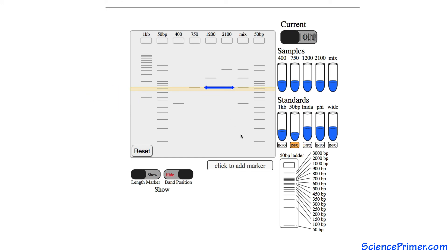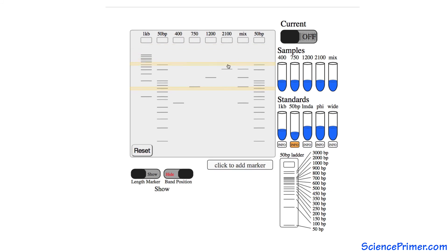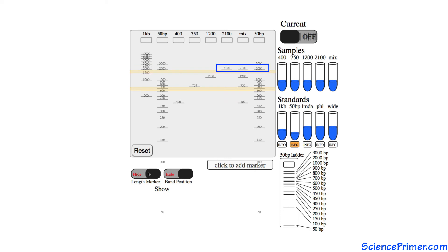Bands at the same vertical position in two different lanes contain fragments of the same length. Comparing the position of each band to bands in a standard allows the lengths of the fragments in the samples to be estimated.